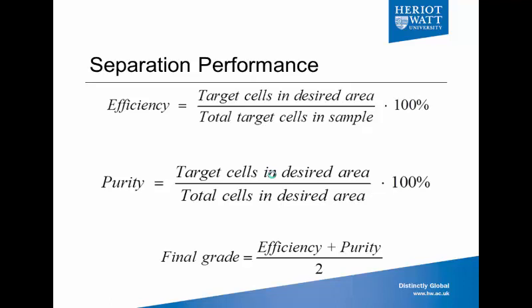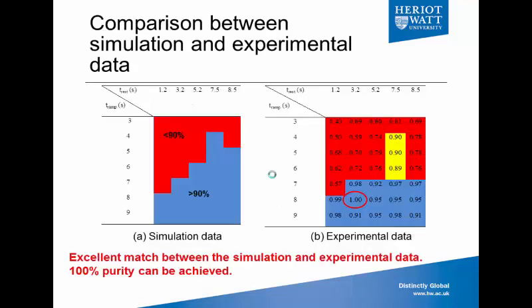Then we looked at the separation performance, of course, calculating the efficiency of the sorting and the purity of the sorting. Again, we compared our simulation program with our experimental data, and what we can see is that there is a good match between the two data.